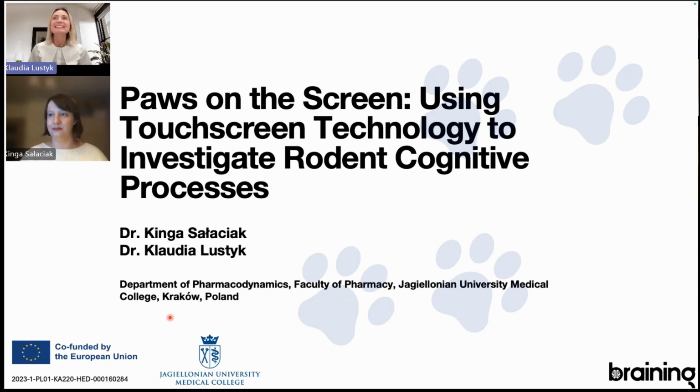Today, my colleague Kinga Sałaciak, also from Jagiellonian University Medical College Krakow in Poland, and I will be discussing the application of advanced touchscreen technology in behavioral testing to assess cognitive function in rodent models. We focus on memory, learning, and also decision making. We will present you the advantages of this method in preclinical research and also its significance for advancing our understanding in human health, neurobiology, and also drug discovery.